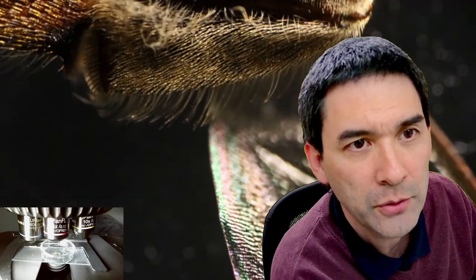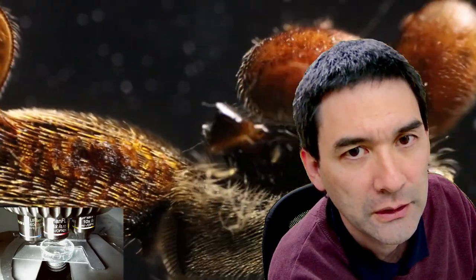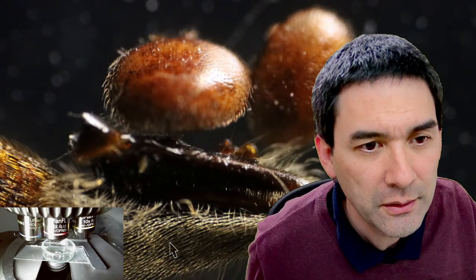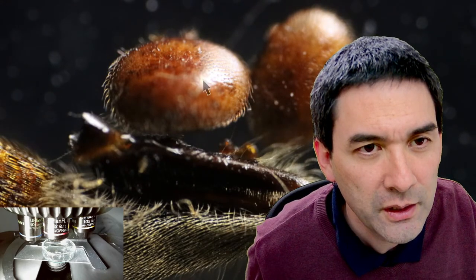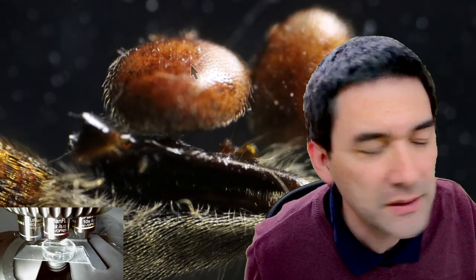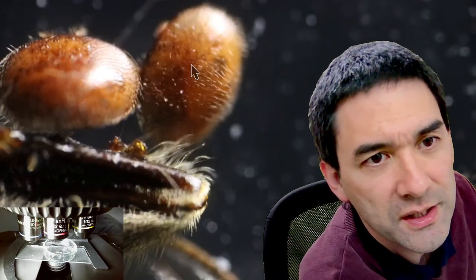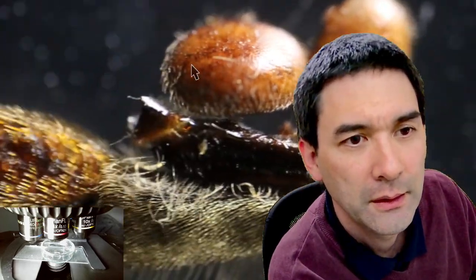When you illuminate it from the top, then you're able to see, I'm using now my low power objective. And you see here, this is already a bee leg, right? Which kind of also fell off. Yeah, here at the top, okay, I'm going to turn on the arrow now so that you see this better. Does this work? Just a second. The arrow, here it is. Now I can move it. This here is one of those mites, the varroa mite. You can also see a little bit the size difference. So here's another one. It's a little bit out of focus. I have to focus this a little bit. So you see the image looks a little bit like the image of a stereo microscope. And I have to look around a little bit. Yeah, here is a wing.